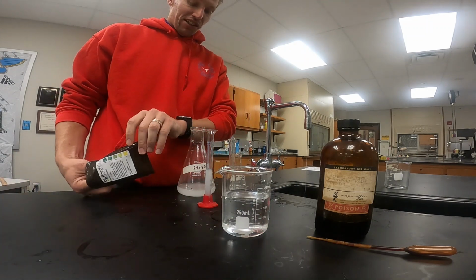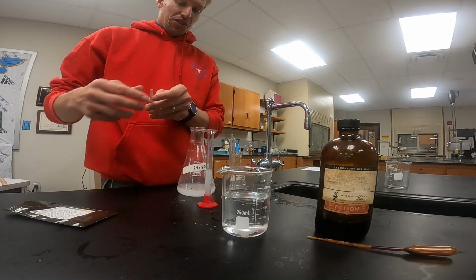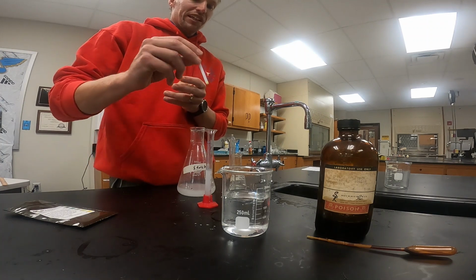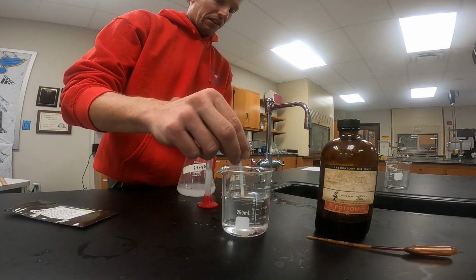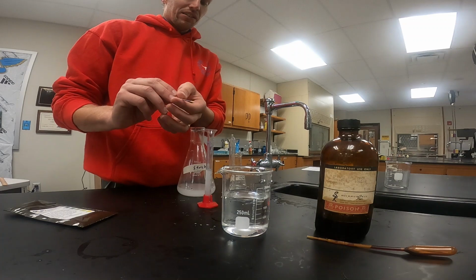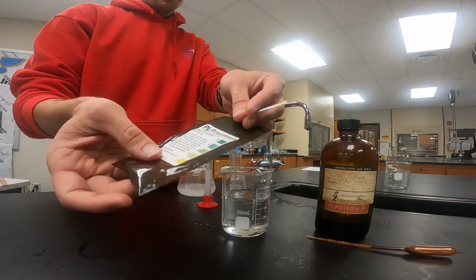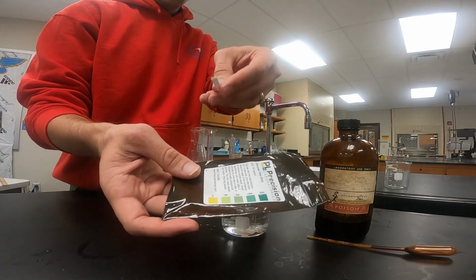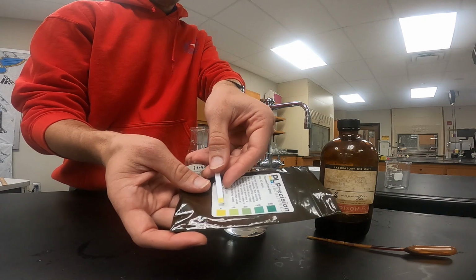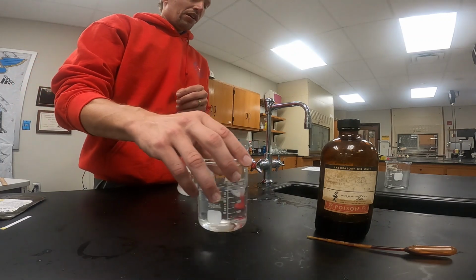So we have these glucose test strips, and we're going to drop one into the beaker and see what the reading is. To do this, you just take your test strip. It's got a yellow tip on the end. You put it in your water for just a couple seconds. You pull it out, and as it starts to dry, you compare it to the colors on our label. So we see which one it matches up with, and in this case, we get a value of 0. So we have 0 parts of glucose in our beaker.